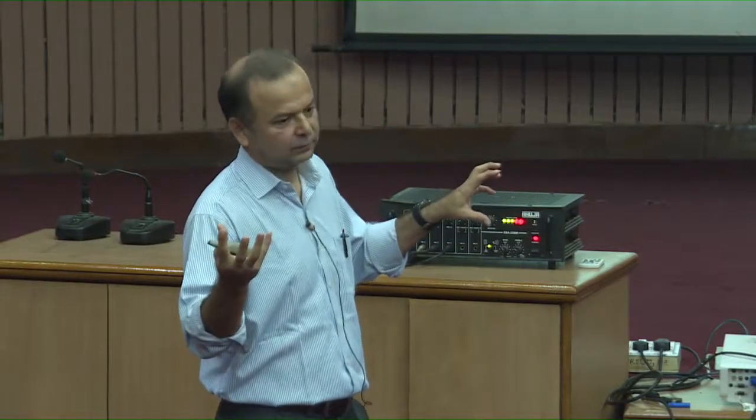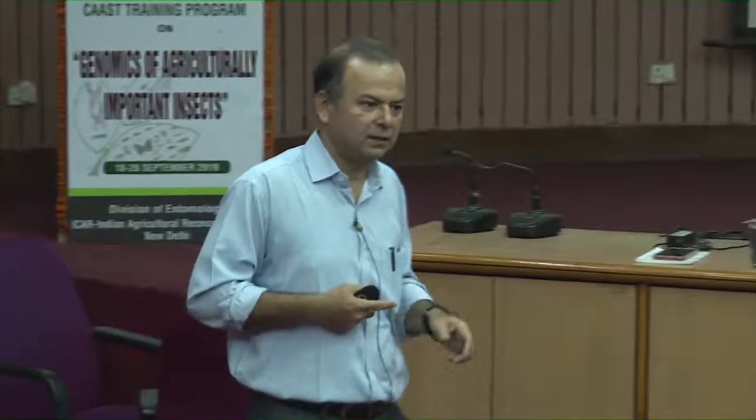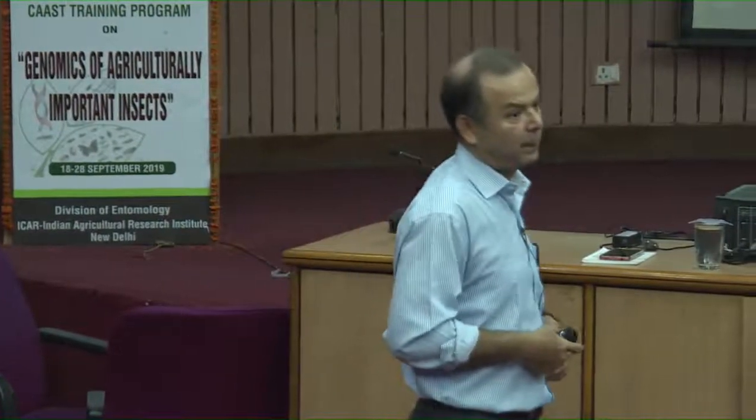Same thing as you have done in protein estimation or any estimation. You have to have a graph where the nanogram amount will be correlated with the fluorescent amount. So, using that graph, any fluorescence amount can be converted into the amount of the target, absolute quantification. So that graph has to be available, where you will take 1 nanogram, do 23 cycles, and see what the amount is; 5 nanograms, do 23 cycles, and see the amount. Finally you plot the amount versus number of cycles and amount versus nanograms of beginning amount, and using that graph you can find the absolute amount.